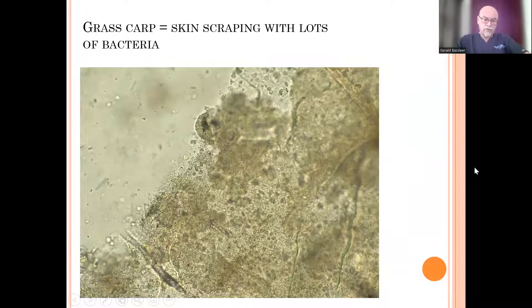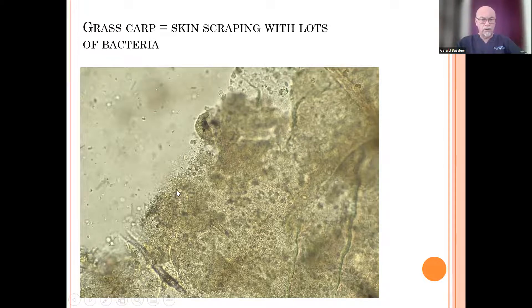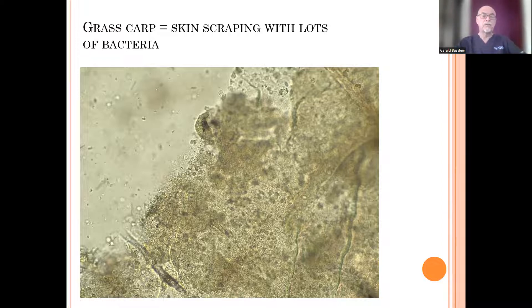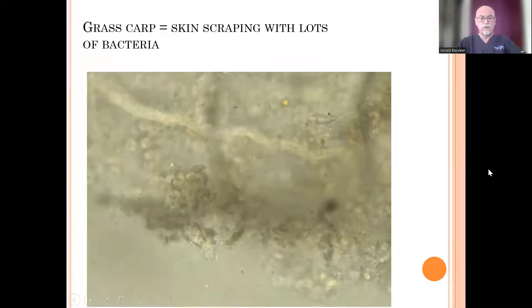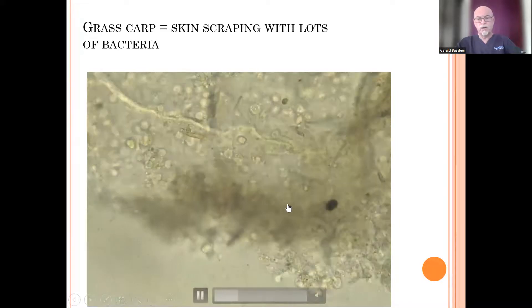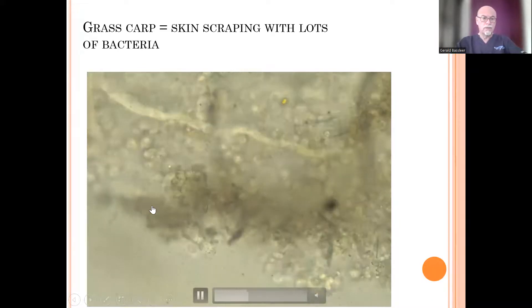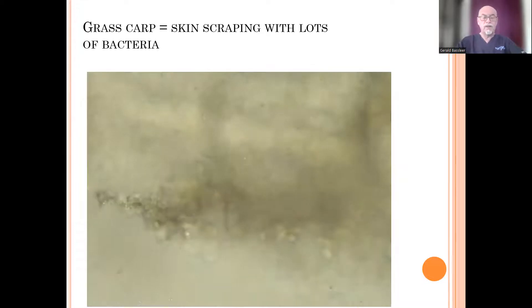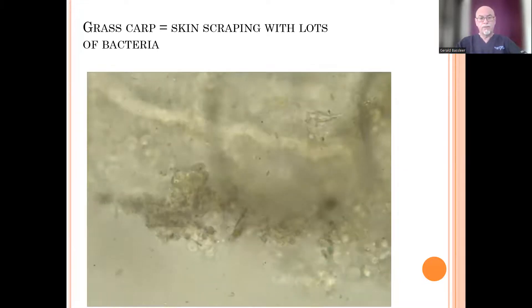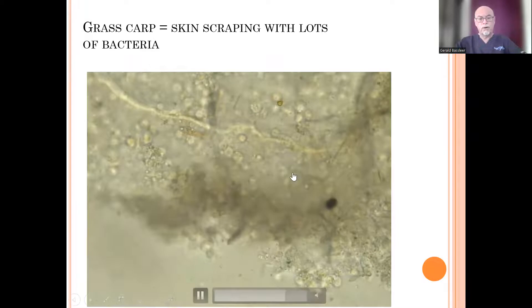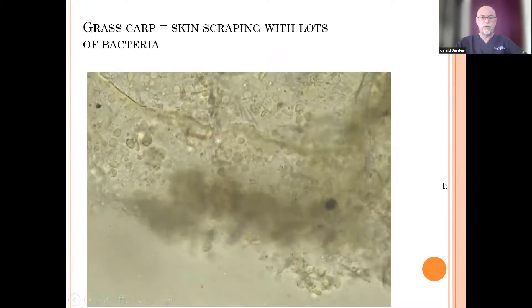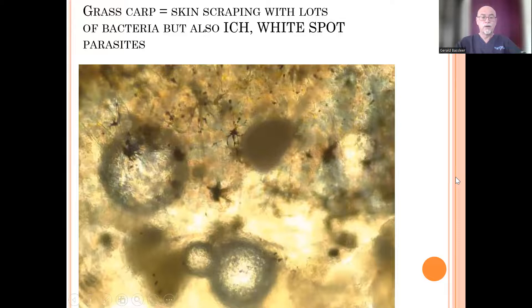We checked first the skin, and after the scrape we found lots of bacteria — colonies of bacteria, probably also some Columnaris bacteria in between, probably two or three kinds of bacteria sitting on the scales and fins of the fish. Here we see it on video — whole groups of bacteria clustered together, damaging the tissue and scales, and keeping the fish in very poor condition.